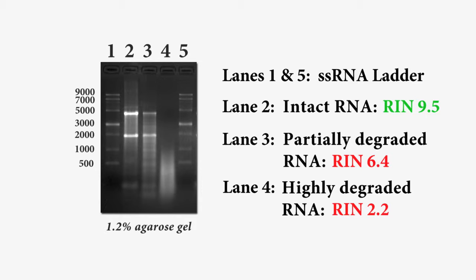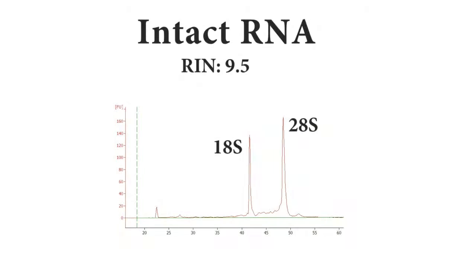For eukaryotic samples, intact total RNA will have sharp, clear bands corresponding to 28S and 18S. The 28S rRNA band should be approximately twice as intense as the 18S rRNA band. This 2 to 1 ratio is a good indication that the RNA is completely intact.